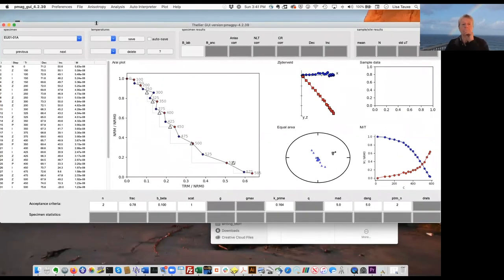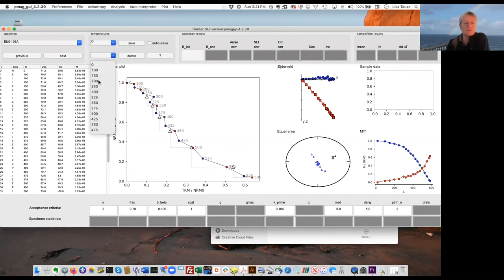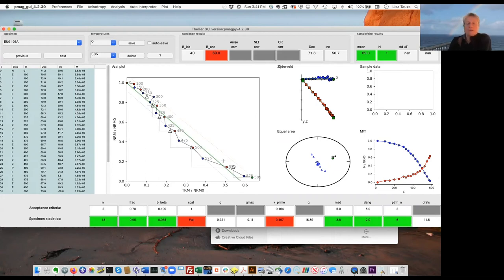Now we can use the auto interpreter, which goes through and finds all interpretations that pass our criteria. For example, I could take this and calculate a best fit line between 0 and 585, giving all these statistics. You can see it's failing scat very badly because this is highly curved — many data points fall outside the scat box. It also fails curvature because this is highly curved and zigzaggy.